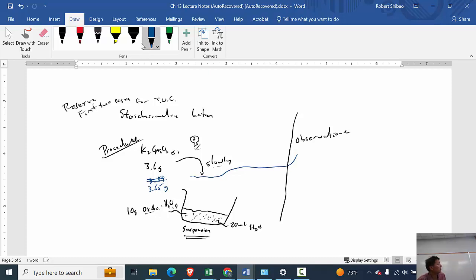Okay, the other thing we need to know, unless you already know it, is what does potassium dichromate look like? Did I already tell you? It's yellow. Chromate's yellow, dichromate is orange, so this is going to be an orange solid. And most likely it's going to be a finely divided solid, so if you sneeze on it, you'll create a cloud of potassium dichromate. And if you create a cloud of potassium dichromate, you want to evacuate. You don't inhale this stuff.